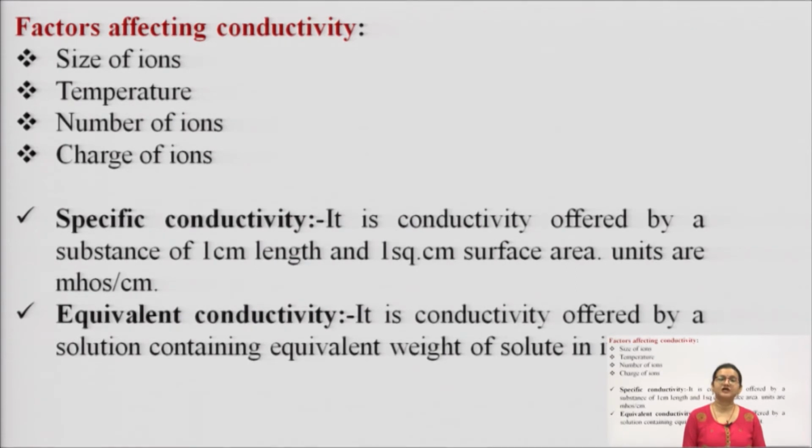If mobility of charged particles gets impacted by any motion, any hysteresis inside the electrolytic solution, or the temperature of that solution, the current generated will definitely be affected. It will also be affected if the number of charged ions of the analyte changes. If the number of charged particles changes, conductance will definitely change, which in turn will lead to a change in voltage generation, and which in turn leads to a change in the amount of generated current in amperes.